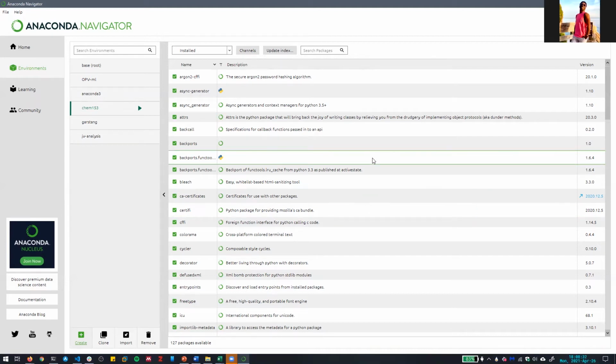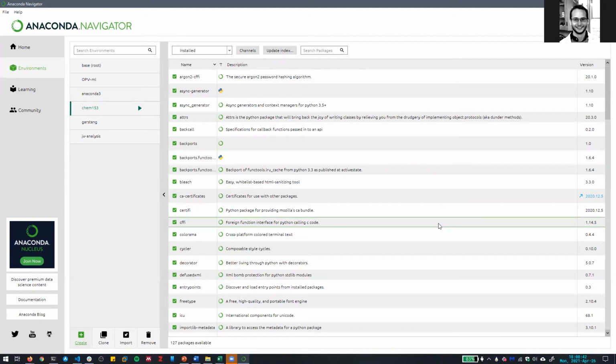You said 64-bit was fine, right? It should be. It depends on your operating system. If you have a newish version of Windows 10, then it's most likely 64-bit. But if you run into problems and it won't work for whatever reason, try the 32-bit one instead.